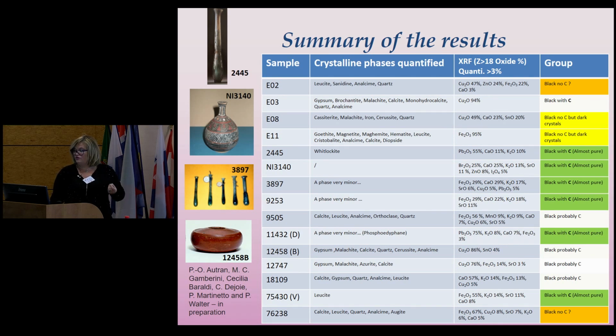You can focus your attention on the green. We had a good result, and I found black carbon in some samples. Usually these black carbons were vegetable. We were not so lucky to find the bone black.